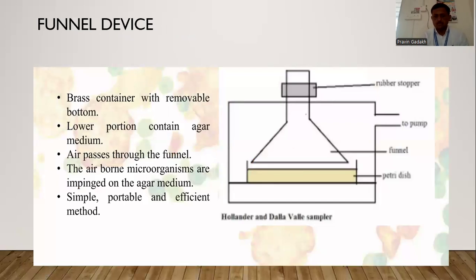So in this diagram, we can see the device which is used for the sampling of air, and that device is called the funnel device. Now we'll discuss the mechanism and how it works.